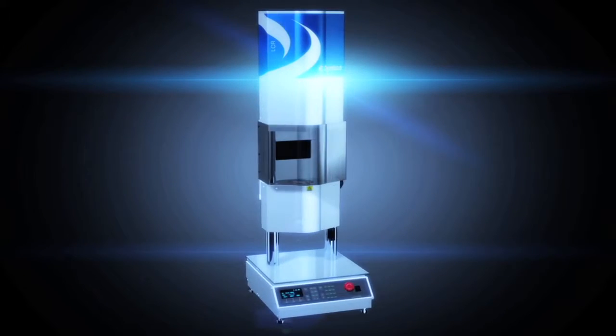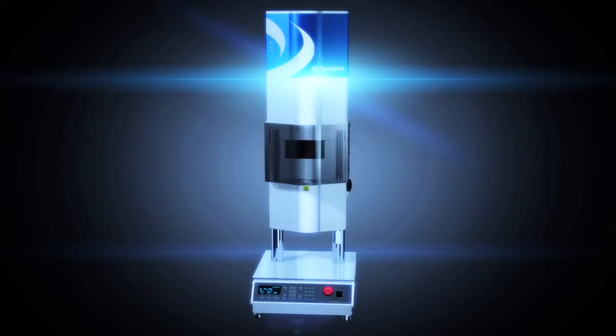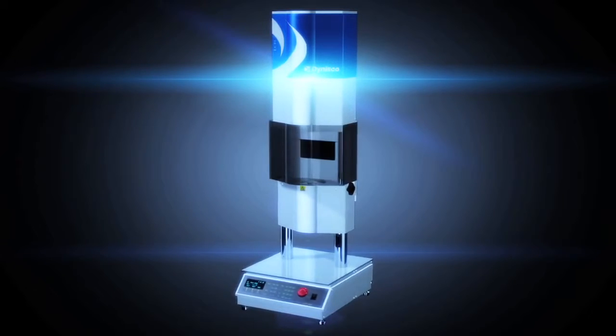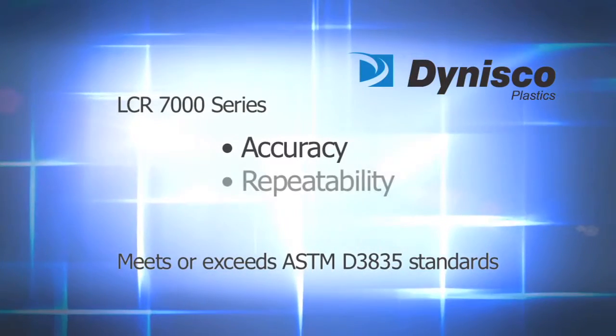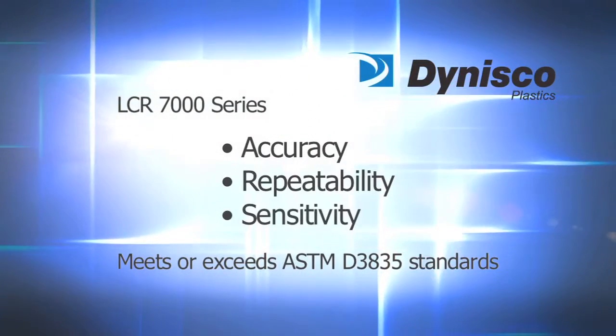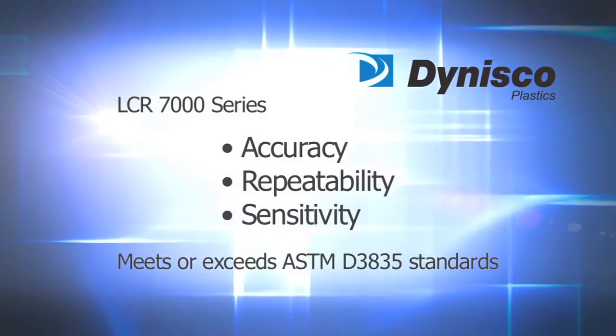The robust precision design of the LCR capillary reometer allows them to provide high levels of accuracy, repeatability, and sensitivity, even under demanding 24-hour operation.